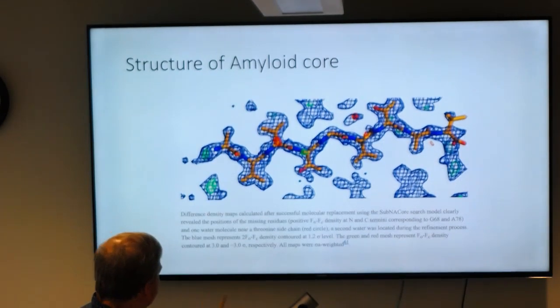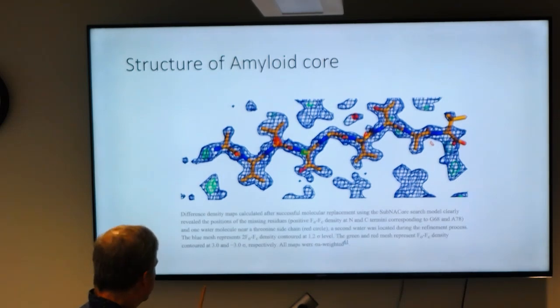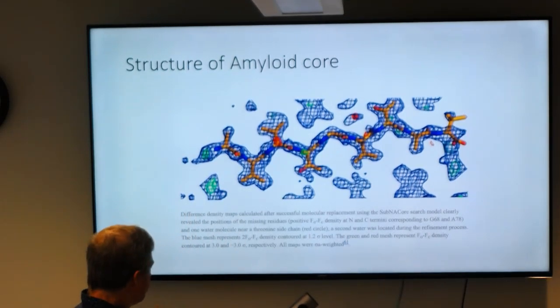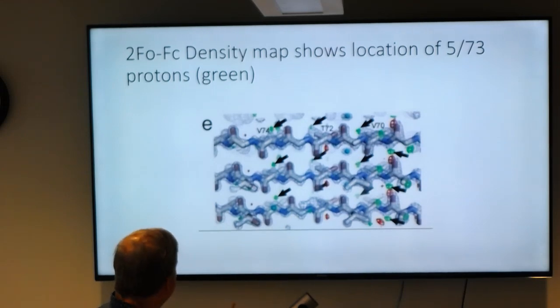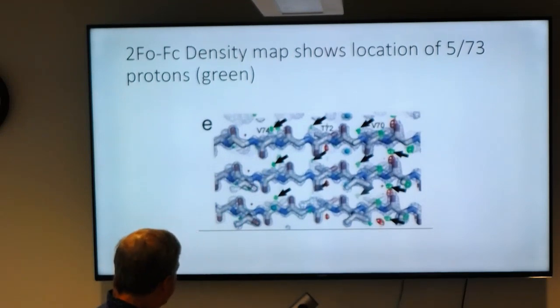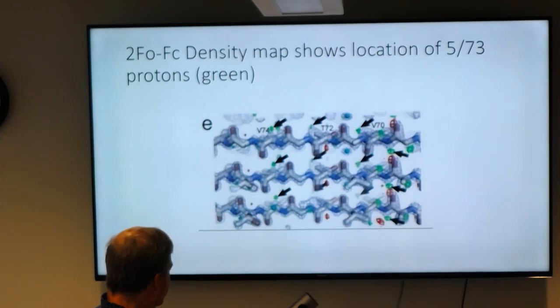And here's just a sample of the sort of resolution you can get, which is extremely high resolution. I think they're at the point where they can see hydrogen atoms in the highest resolution structures. So if you have a really small peptide or something, you get nice little microcrystals of it, and you can get actual resolution down to sub-angstrom.